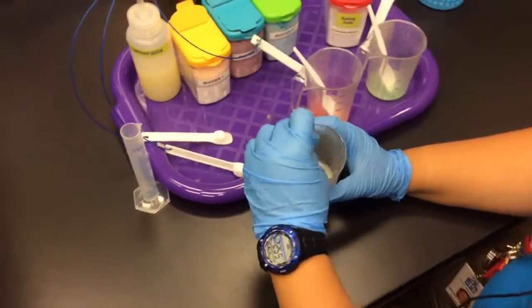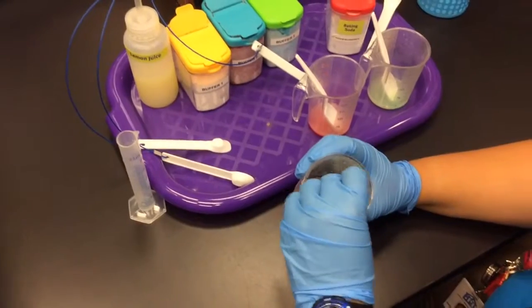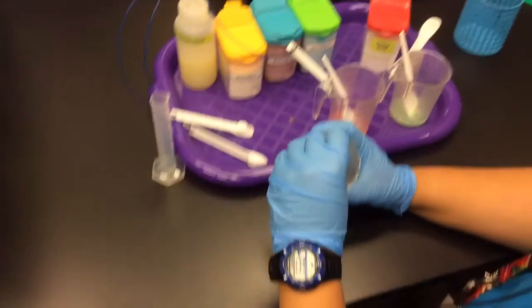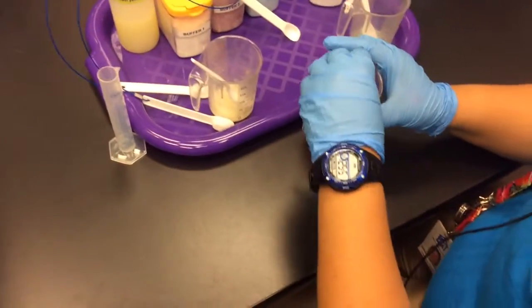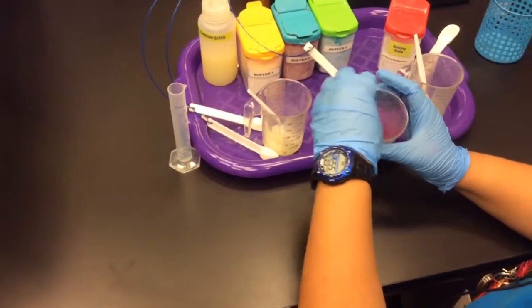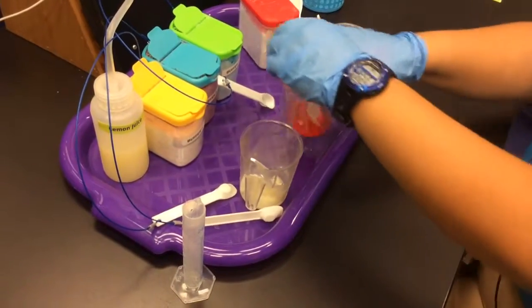What that's going to do is spread our samples as much as possible. I'm just going to break it up so that it can dissolve inside that liquid, which is what you want. You want as much of it to dissolve so that you can actually see the buffer effect. So we're stirring up our second, making sure we are mixing and distributing all the molecules in our liquid sample.